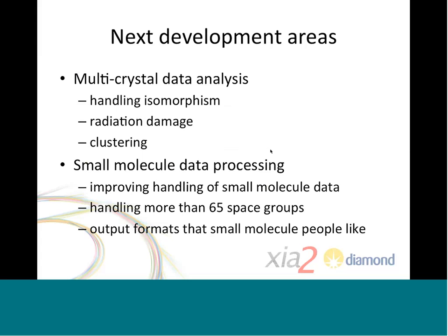The next development areas for focus are primarily on multi-crystal data analysis and on improving the small molecule data processing. The first of these has got to improve the handling of isomorphism and radiation damage and clustering and so forth.